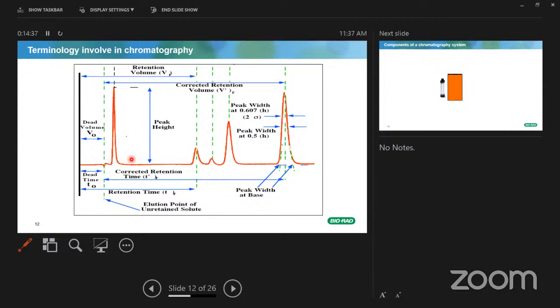Somebody asked about baseline correction in the previous lesson. Talking about baseline correction, this is basically the baseline. If it has not been corrected, you may not get a pure result. So you need to do a baseline correction with respect to analyzing the peak area under the curve.